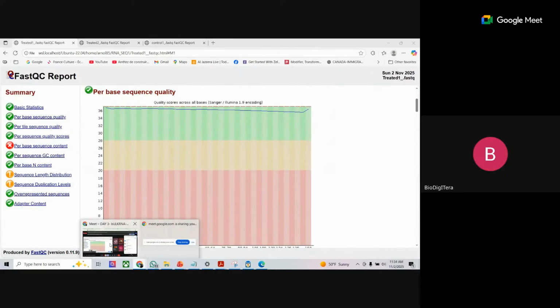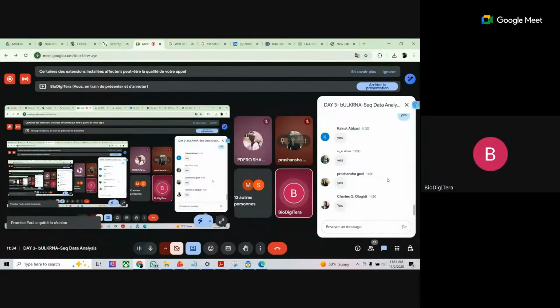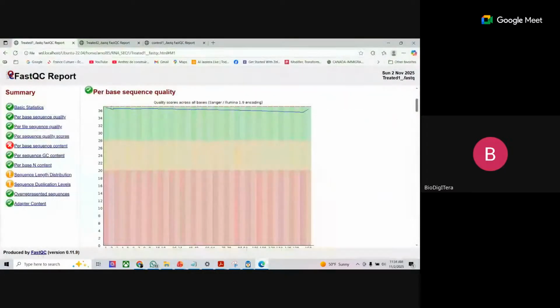I want to make sure that you understood that explanation. Is it okay? Did you understand the explanation I just gave you? Yes. Because for a job interview, or to show someone that you understand, you are not just analyzing. You are able to give an interpretation to the report that we have used FastQC to generate. You have to give explanation. So you must always check adapter, overrepresented sequence, and per base quality score.